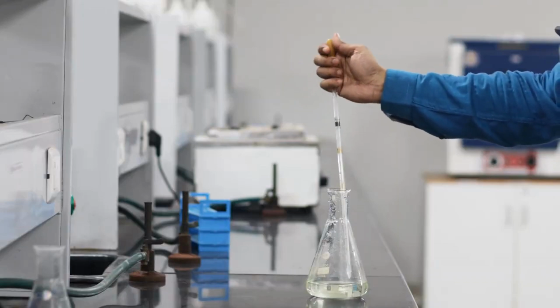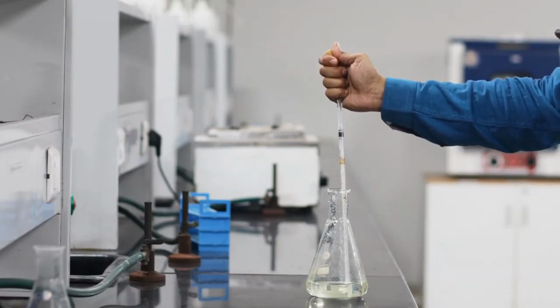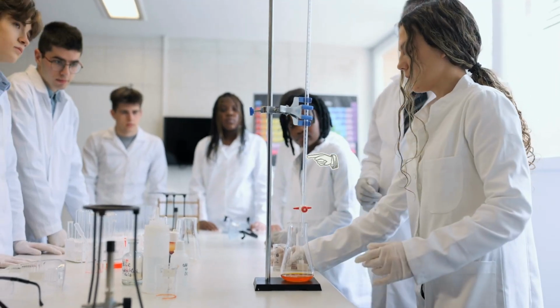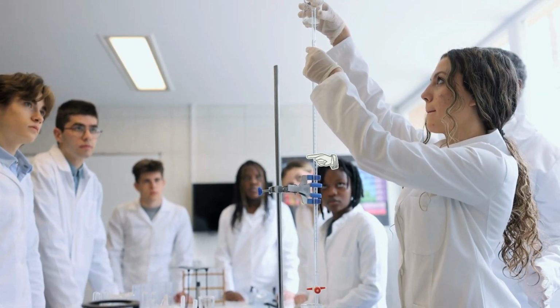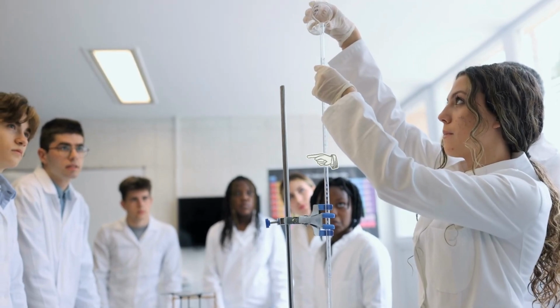This is a volumetric pipette. It is used to accurately transfer a measured volume of liquid from one container to another. This is a burette, and it is used to accurately dispense precise volumes of liquid. In this video, it is used as part of a titration setup.